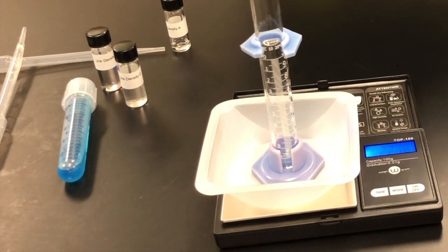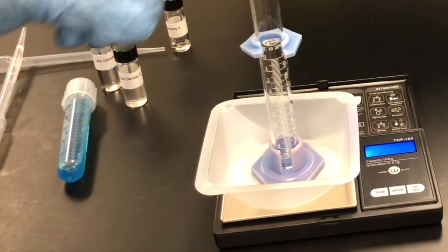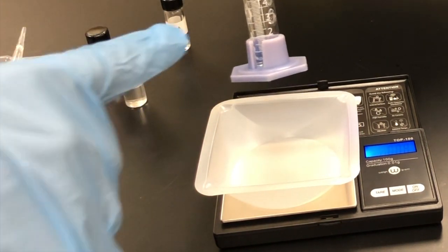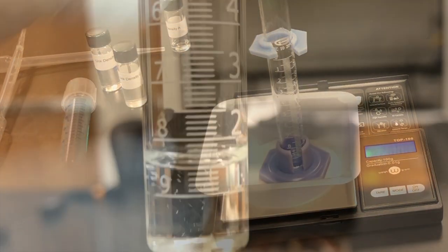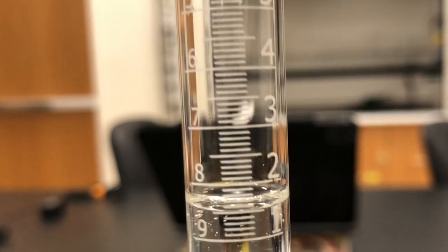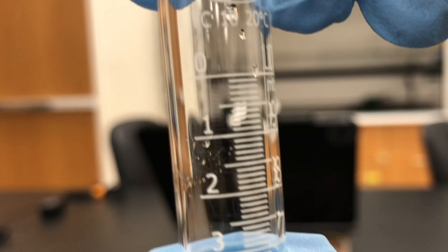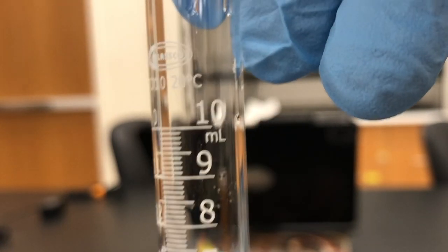The next thing that you want to do is read the volume. In order to read the volume, you've got to wait till all the liquid settles, because you can see that I've got some liquid on the side. And again, on your graduated cylinder, at least this one, it goes from 0 to 9 going to the bottom, but the other one goes from 1 to 10.